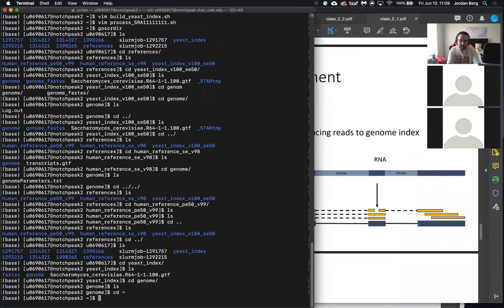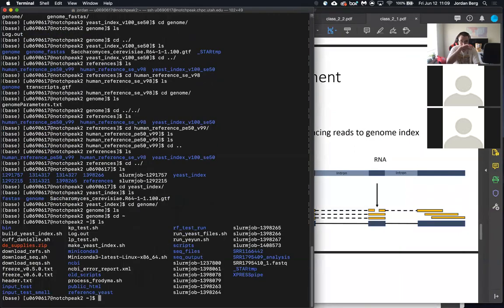But what happened with me was, I made the whole bash script for the 8 files, and they were downloaded, but each file made a separate folder with its own name in my home directory. There was no NCBI folder generated.